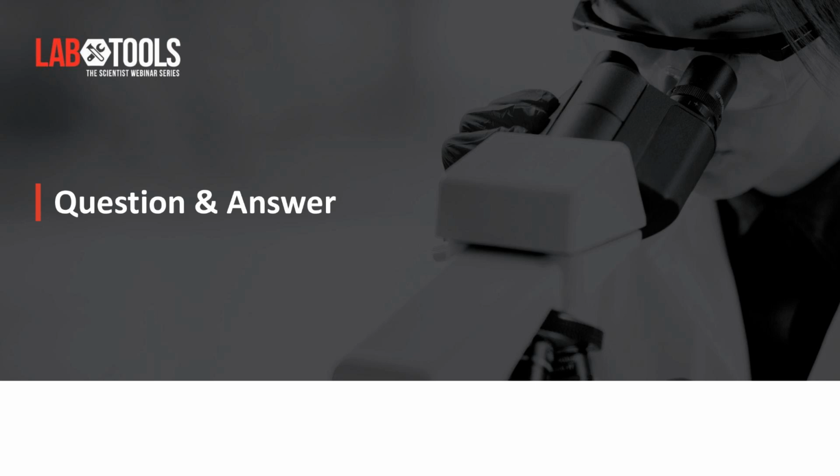So actually, 500 is the maximum we propose as a service, but definitely the technology is able to go much longer, and I would say that in R&D we are doing like 1,000 base pair, no problem. It's just that the price, of course, is kind of expensive at this size, and when you pay this price, you want to have at least a certain amount of correct sequence. So for now, it's not yet commercial, but it can go longer than 500.